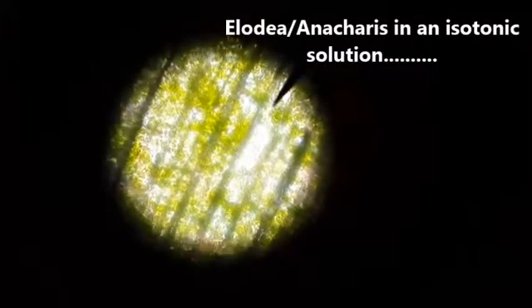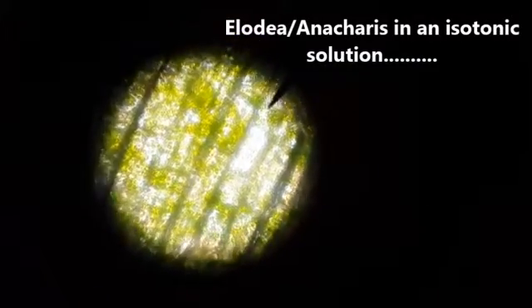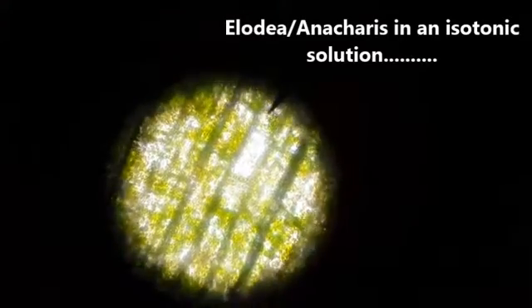One thing that is so cool is when you look close at this picture, you can see that the chloroplasts are moving. The inside of a cell is not static but it is alive. Look real close, you can see the chloroplasts moving inside. Cells are not static things, they are moving, living entities.